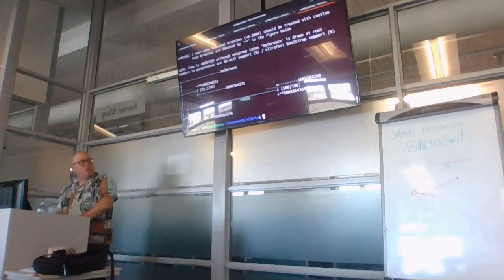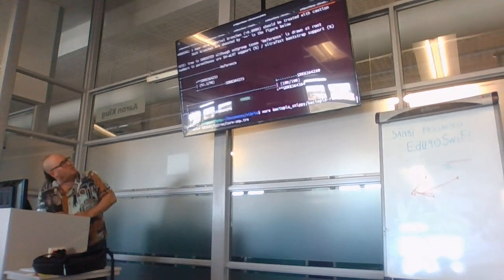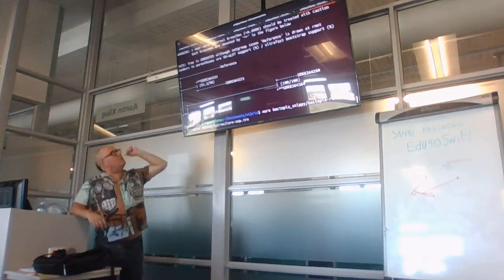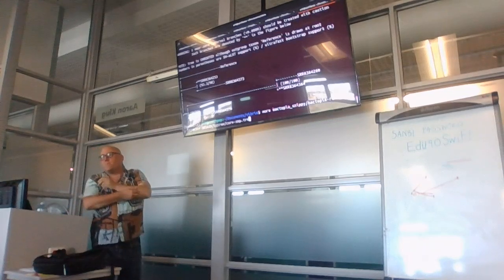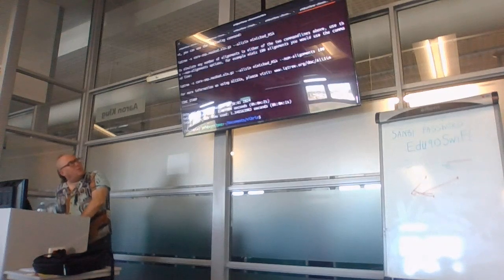And then in the same folder, it explains it in the text. Numbers in parentheses. I don't know what SH-aLRT is, but ultra-fast bootstrap is the second number. It says it's unrooted, but there are two. Oh, is there? I think those are the consensus of the two trees. Is the rooted tree below that one? Yes. Okay.